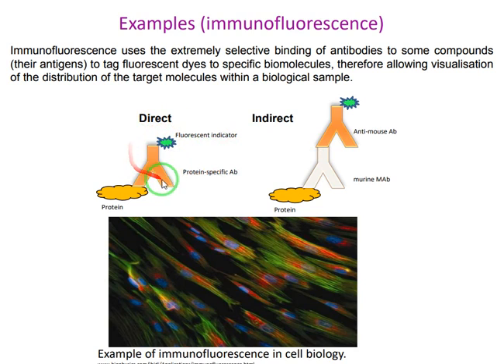In this case, only one antibody can be observed on the protein due to these antigens, but in this case several antibodies can be observed, and the light intensity that we get will increase. And again, I have to mention that this method, although it may seem that because two steps are needed, it will be more time consuming. Okay, it may be, but it is more cost effective.